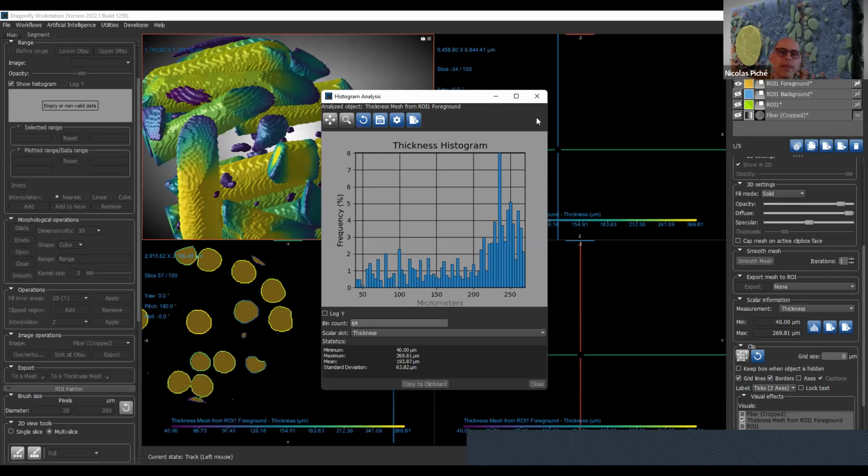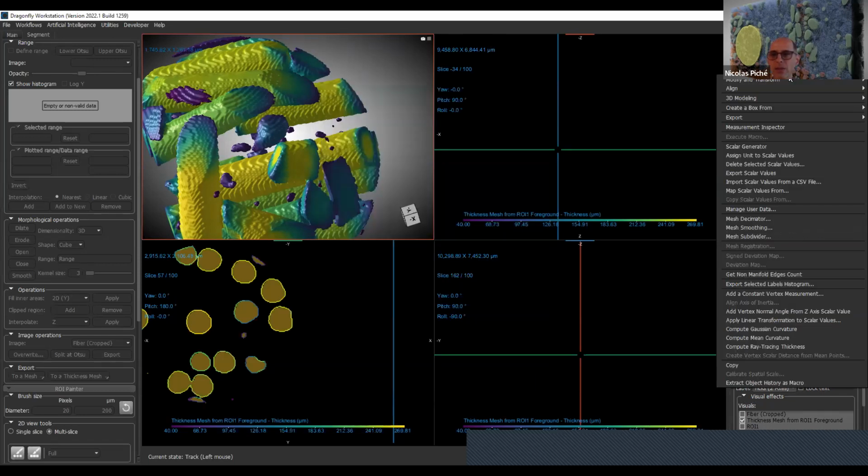Also, as an unstructured grid, and also with the multi-ROI, I can map scalar values from something else, from a dense representation, meaning I want to put the value of tone of gray, in that example, on the surface of the mesh. So each vertex will pick the value of the dataset and put the tone of gray as a scalar value in it.